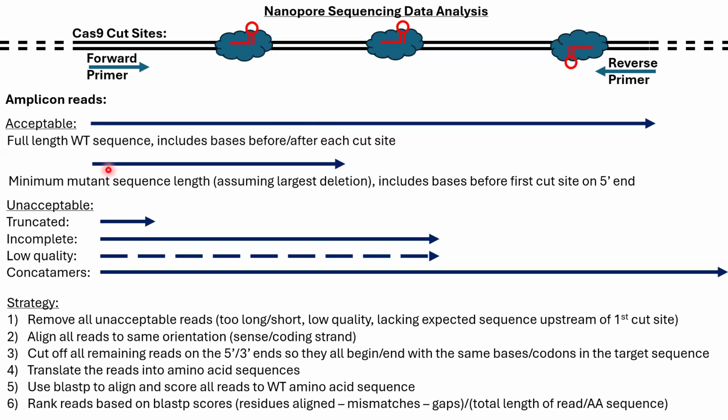Okay. Also, we would accept reads that are as short as a length that would be the whole wild type read, but accommodating the deletion. So if this is a 500 base pair read, for example, but my Cas9 target sites here, if they're all chopped up, then that will remove 150 bases. Then my minimum read would be 350 bases long, okay? And maybe we shorten that a little bit to allow for additional bases being deleted at each cut site.